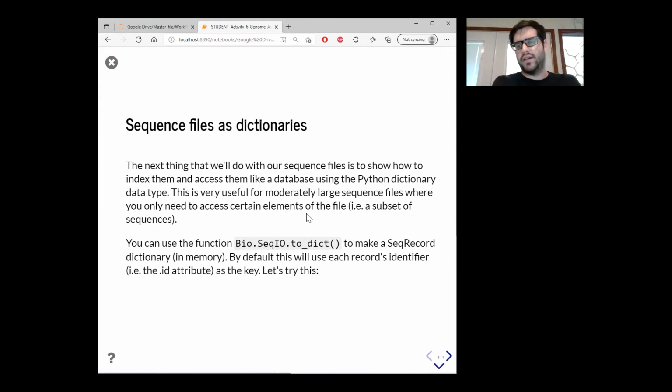We can create a dictionary and keys, and then call individual keys and export them to a separate file. A big challenge in bioinformatics generally is working with different data types and parsing files, removing things, cleaning them up.